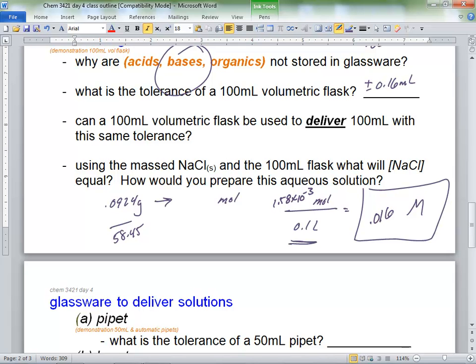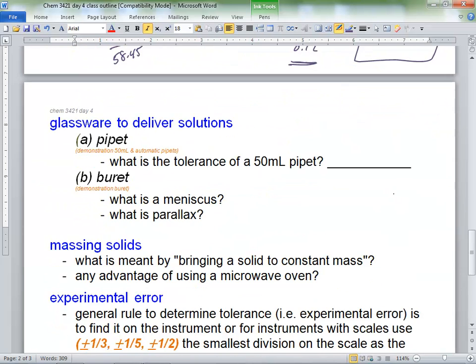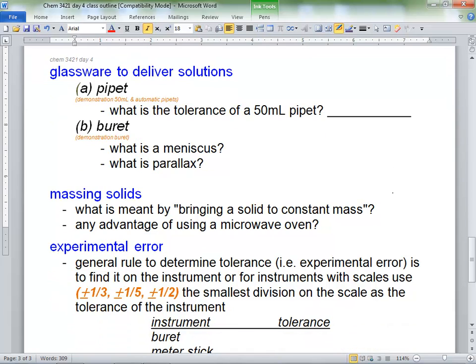Okay, so something like that, right? And you saw how we mix it and how we prepared it. How about the pipette? You remember how to use these things? They are probably the least fun thing that you've used. Remember, first you get the air out of the top. Remember doing this? I should have you guys demonstrate this instead of laughing at me.